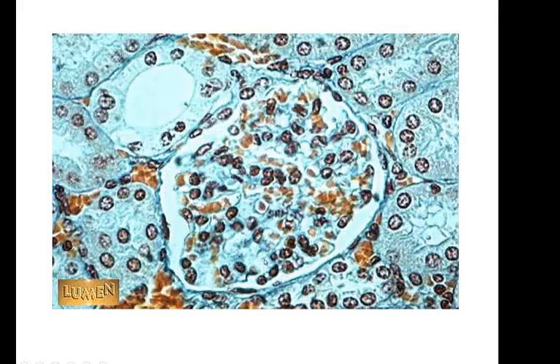This big huge thing in here is called a glomerulus. It's a ball of capillaries inside your kidney, and this is where urine is being formed, and the urine is squeezed out into this area here called Bowman's capsule, and Bowman's capsule is lined with simple squamous cells. So this is what simple squamous cells look like in your kidney.